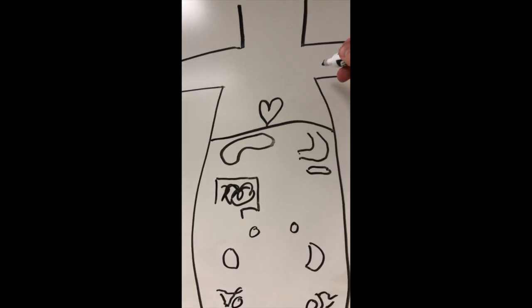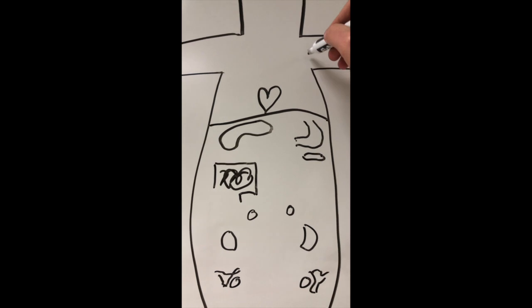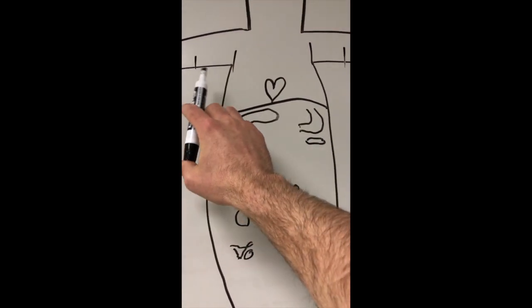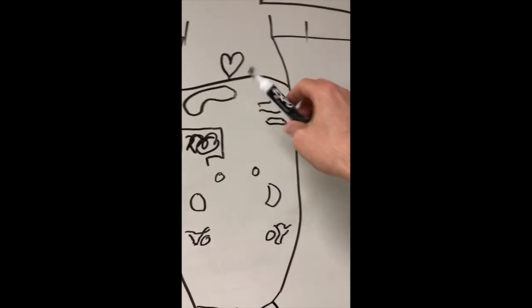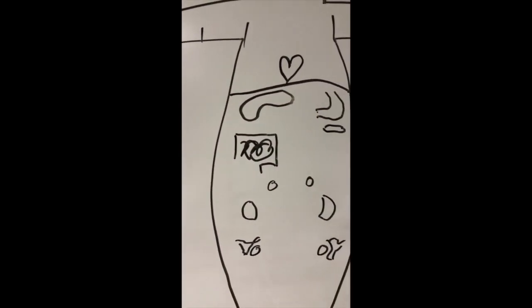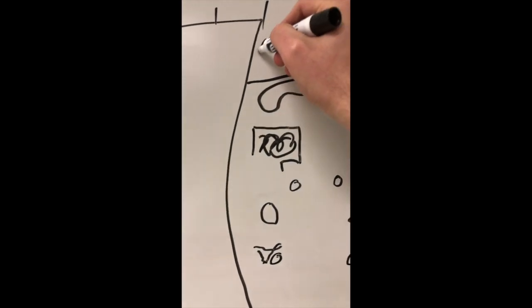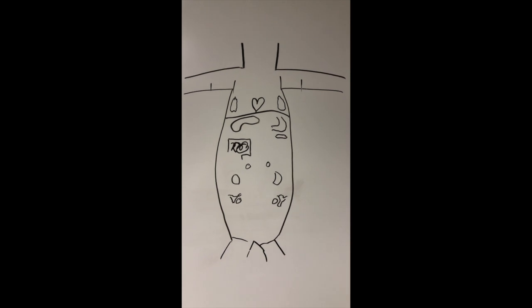We're gonna go ahead and throw in a few more divisions as well. Some of these might seem a little artificial, but they'll definitely be helpful when it comes to naming the arteries as we go along. So we'll throw down a division right here and another sort of artificial division right there. This is gonna be to separate the brachial region from the axillary region from everything else within the thoracic area. And so we'll throw in some quick little rudimentary lungs here too. All right, so here we have a really basic mink with representations of the organs.